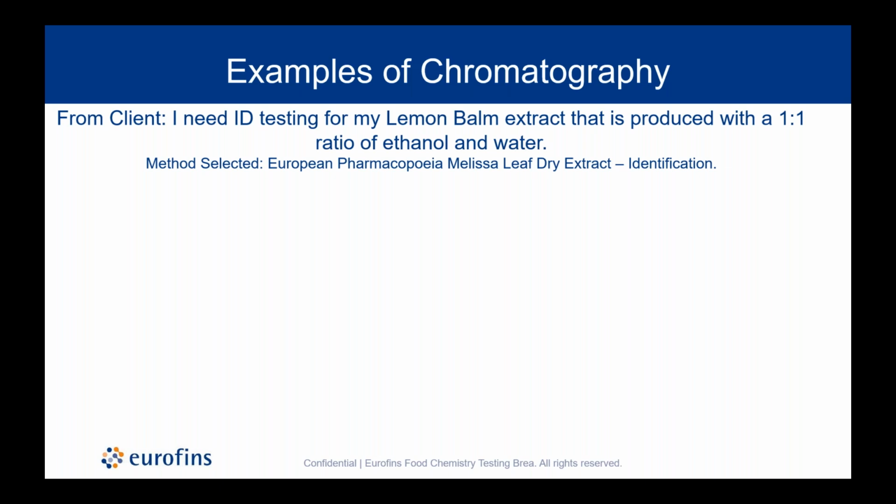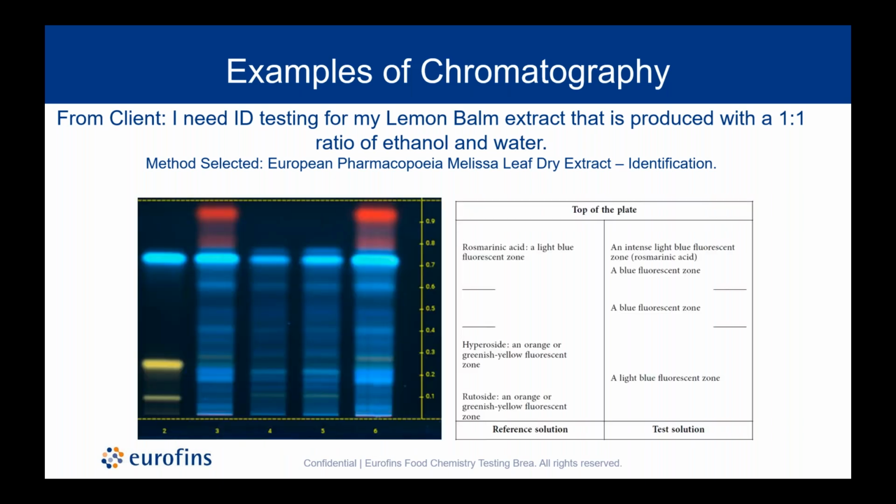Another question, is there ID testing for a lemon balm extract, in this case produced with a 1-to-1 ratio of ethanol and water? If we remember back to that earlier slide, there was that hydroalcoholic extract in the scope of that Melissa dry extract monograph. And so that is what you see we selected as the European Pharmacopoeia Melissa leaf dry extract identification test. And we have our plate image again with our acceptance criteria.